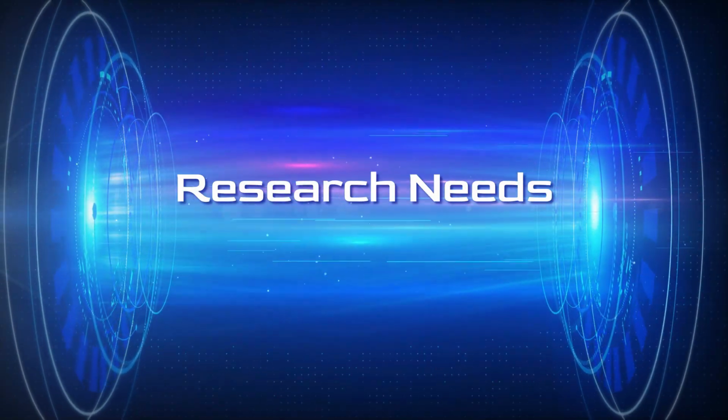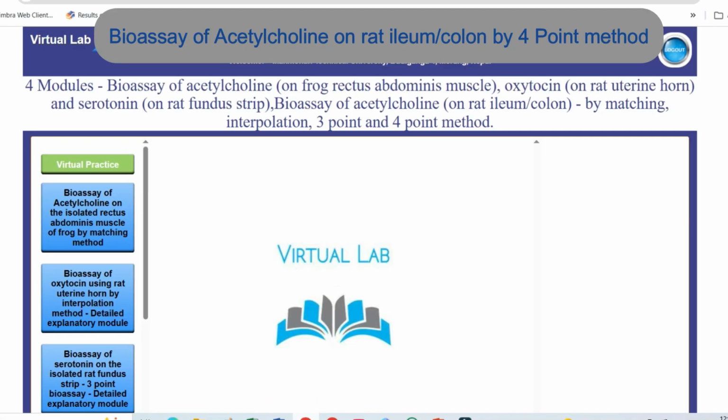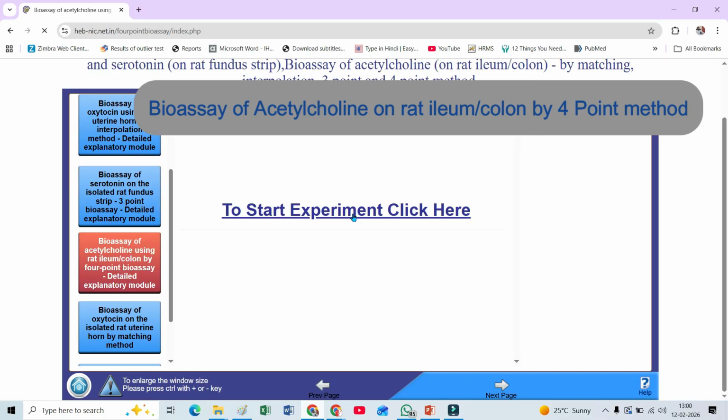Today in this video we will see bioassay of acetylcholine on rat ileum or colon by the 4-point method. So we will go inside and click enter. We will select here bioassay of acetylcholine using rat ileum colon by the 4-point bioassay, select this button and click enter.